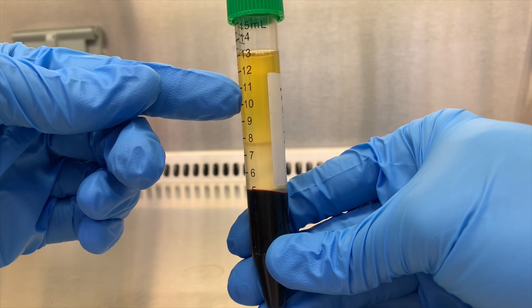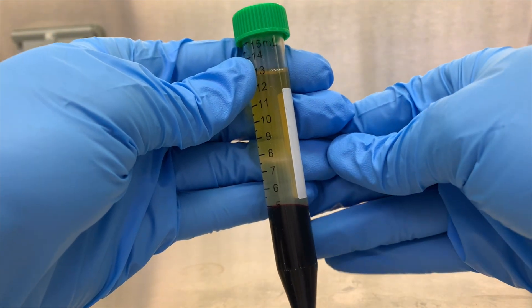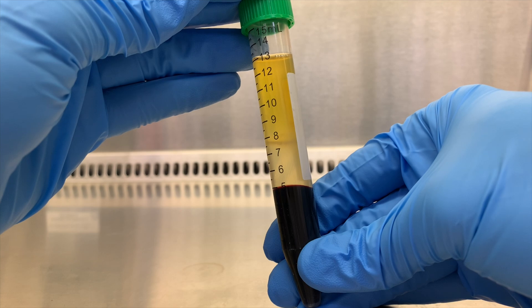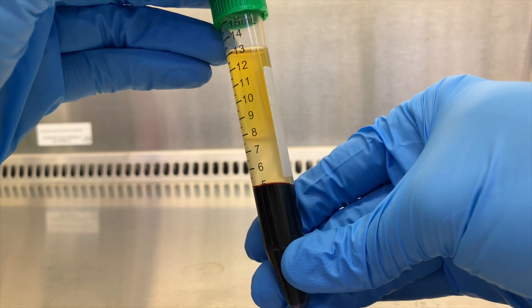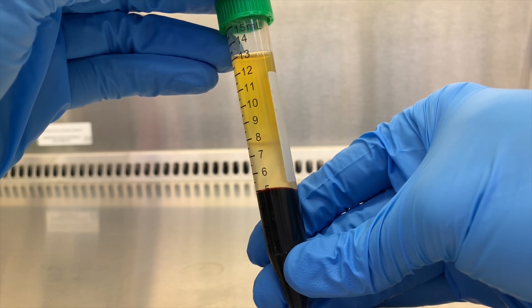It's all about density here. So why would you want to isolate lymphocytes? Well, it's useful, especially in a clinical and research setting, to test the function of different white blood cells. Too many red blood cells can interfere with some assays and lymphocyte function, especially since most whole blood samples will be full of damaged or dead red blood cells. Isolating PBMCs can also be useful for scientists who want to create a biobank and use those cells in the future, as red blood cells are more fragile than white blood cells. As those RBCs die, they can release stress proteins that can affect the white blood cells.